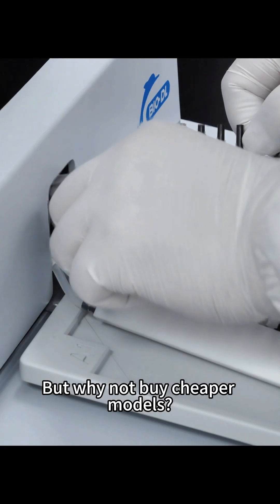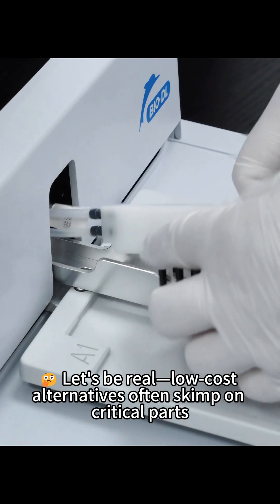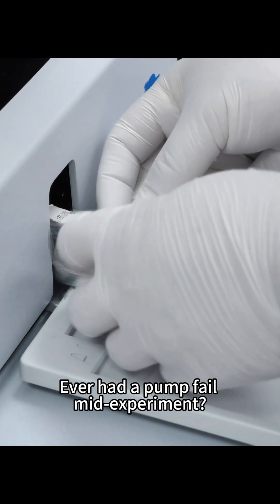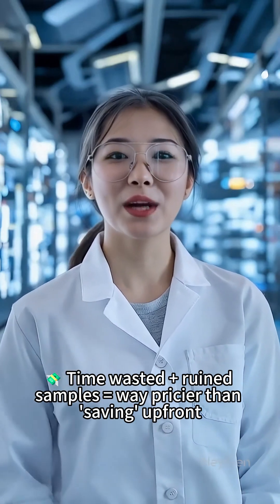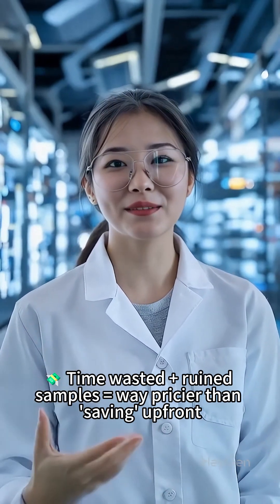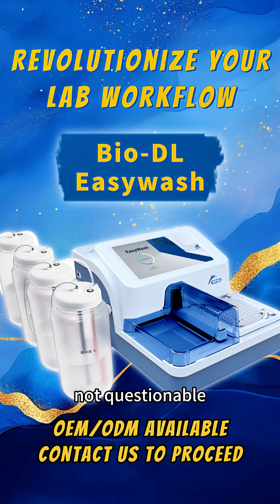But why not buy cheaper models? Let's be real — low-cost alternatives often skimp on critical parts. Ever had a pump fail mid-experiment? Time wasted plus ruined samples equals way pricier than saving up front. BioDL's premium quality ensures your data stays reliable, not questionable.